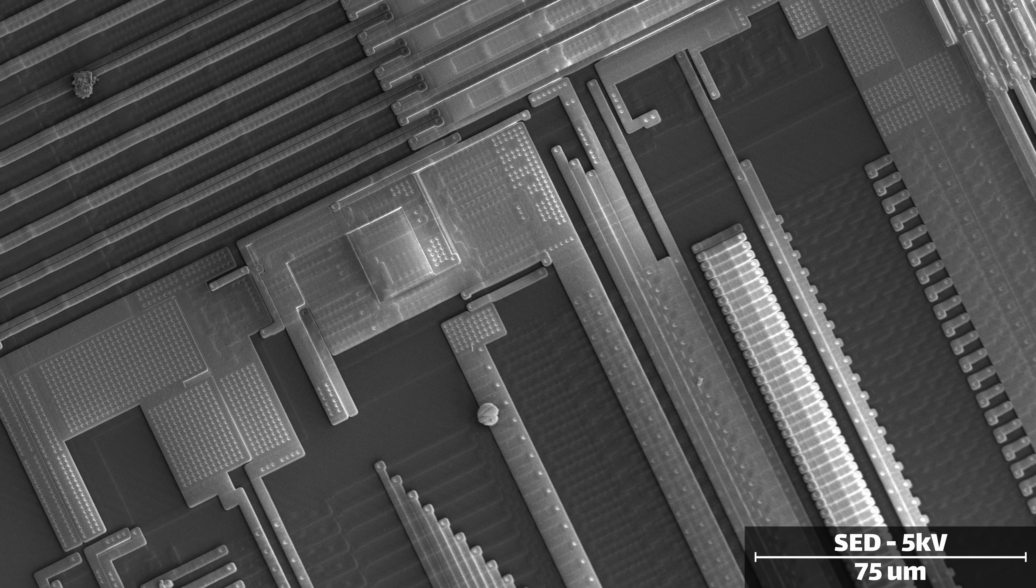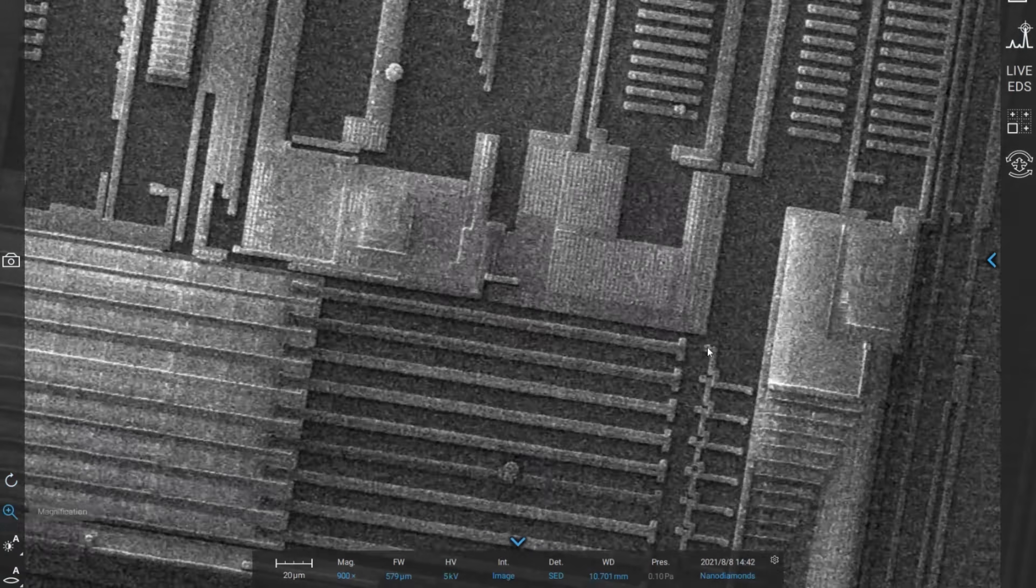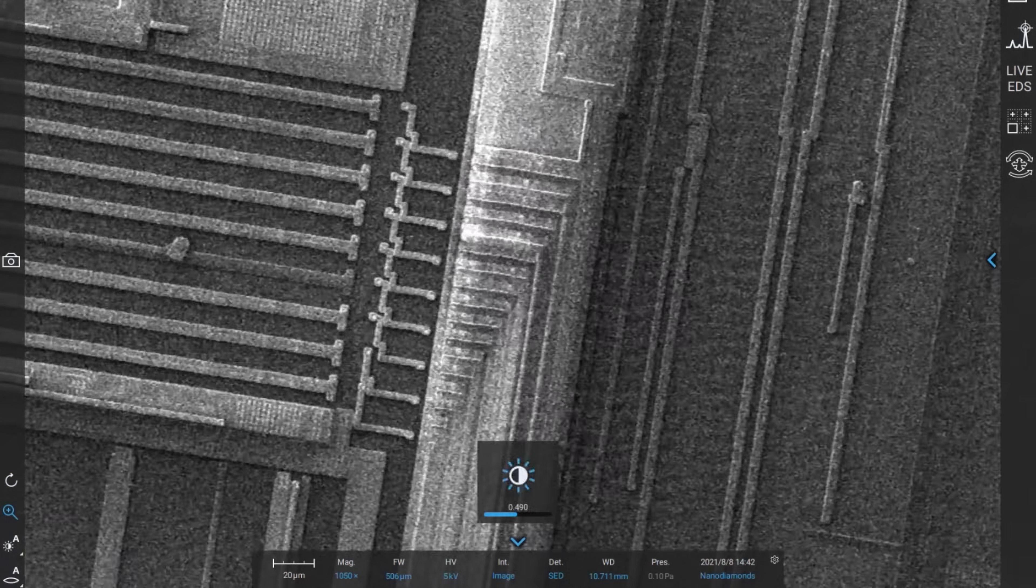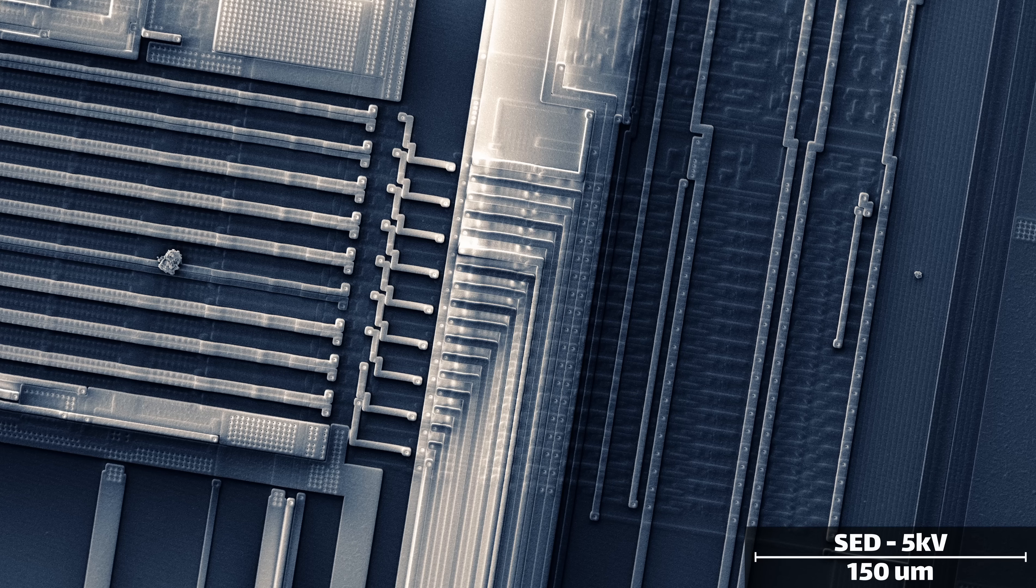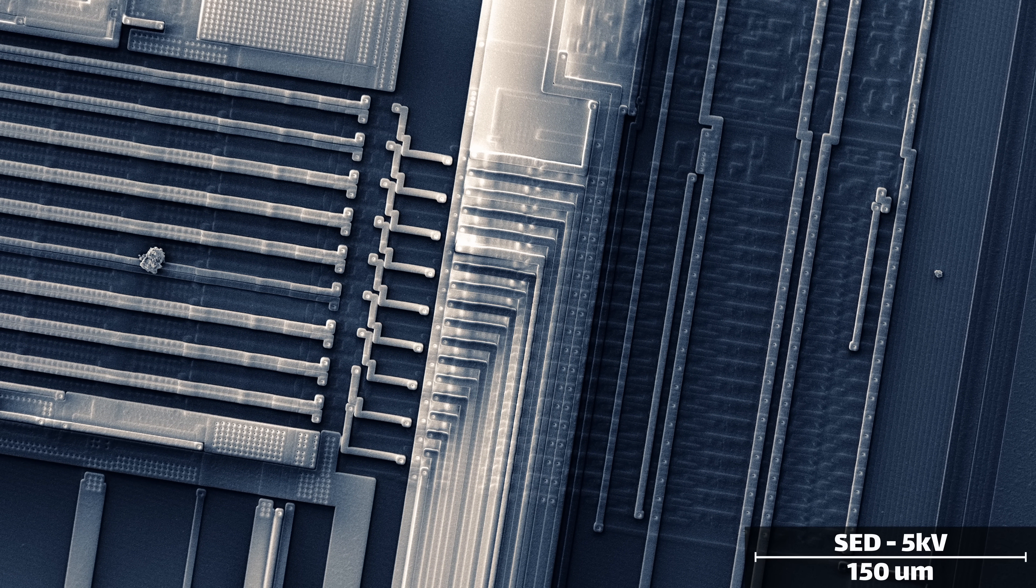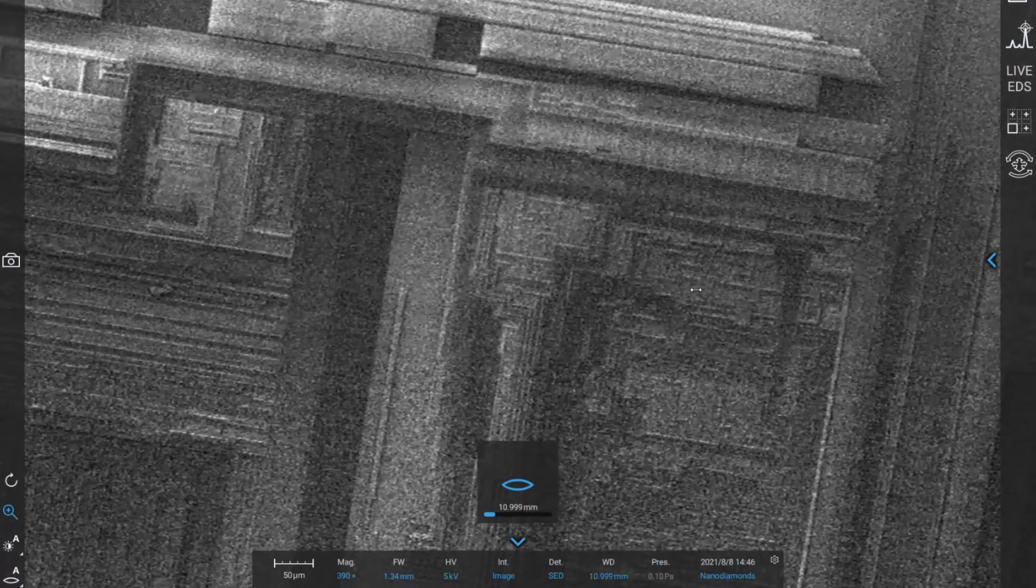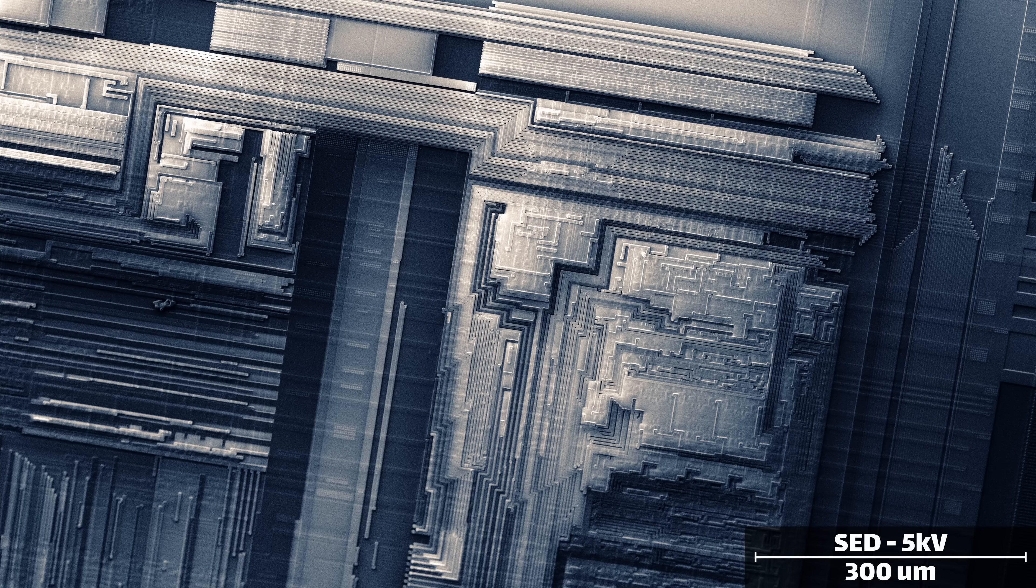This seems counterintuitive. You'd expect the surface of a precision device like a silicon wafer to be ultra-flat. But in reality, as layers are deposited one on top of the other, the surface becomes increasingly rough, as each subsequent layer distorts the surface a little bit more.